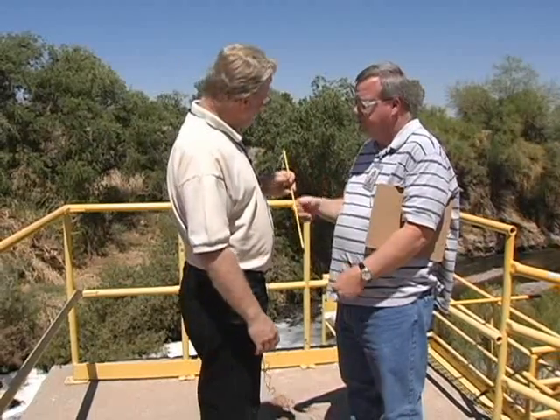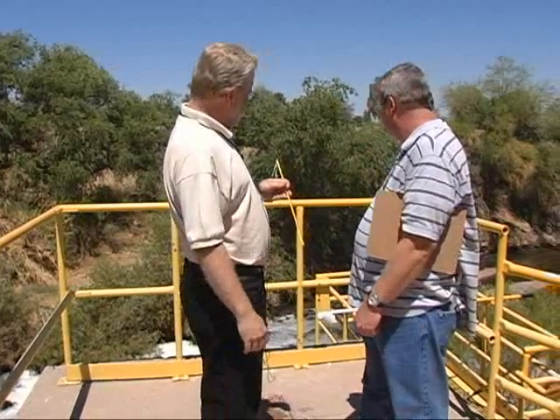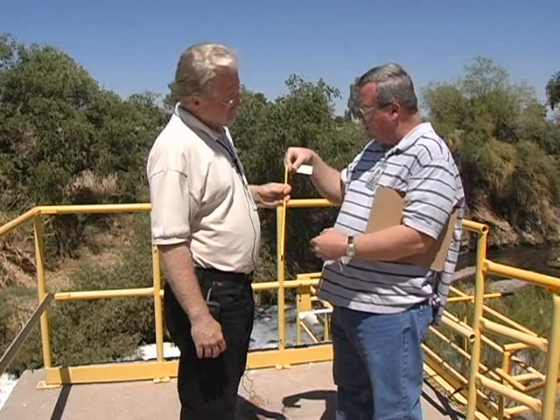I saw that you have a sampling device here that you use for your outfall. Describe to me how you take your samples here. We have a scoop with a cup on the end — we'll take the scoop, dip it into the outfall three times rinsing it out, and then collect our sample. We'll bring it up, take the thermometer, place it into the scoop with the sample to the immersion line, allow the temperature to stabilize, record that temperature, subtract our correction factor, and that's our reportable temperature.